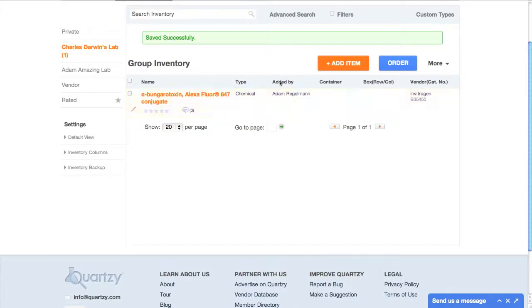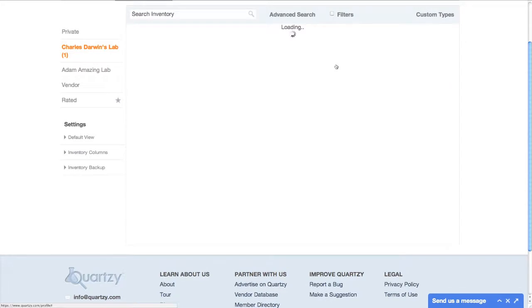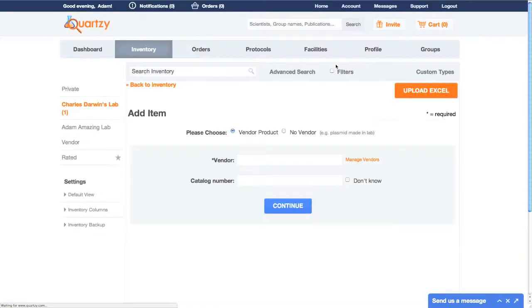The second way Quartsy makes it easy to get your inventory onto the site is by allowing you to upload thousands of items at once. Let's say I already have an Excel file, or I've exported my FileMaker database as a CSV file, and I want to upload it onto Quartsy — well, we make that as easy as pie!